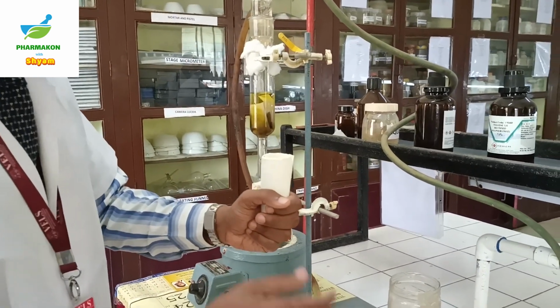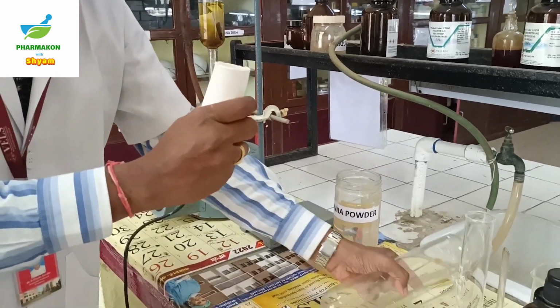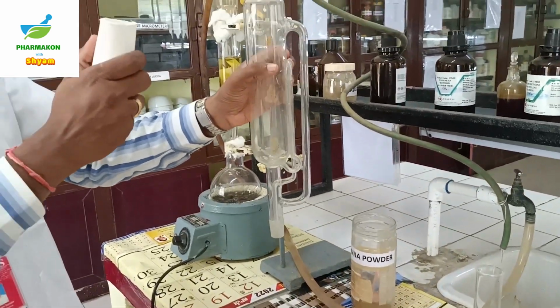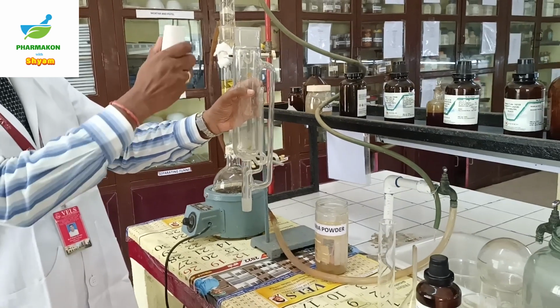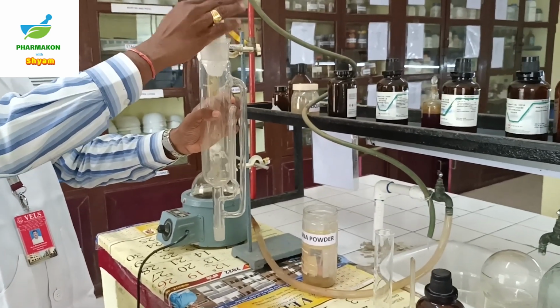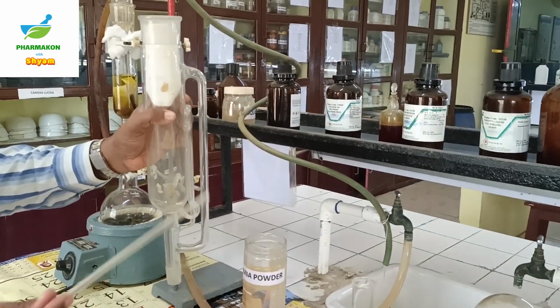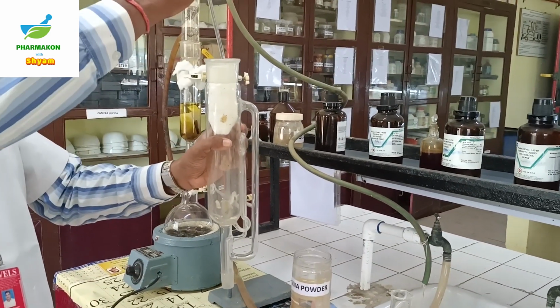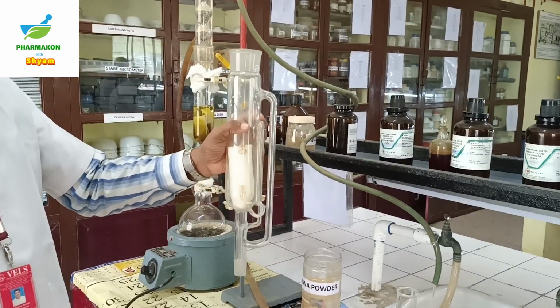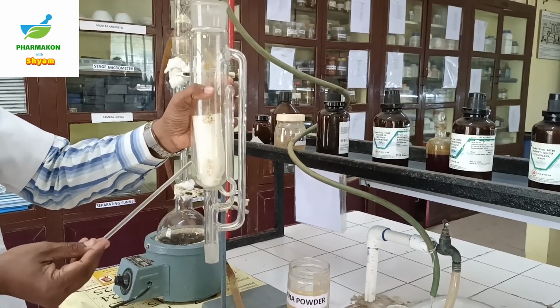and after packing the material into the thimble, take the Soxhlet extractor and place the thimble along with the packed material into the Soxhlet extractor. Use a glass rod gently to pack the material into the Soxhlet extractor.